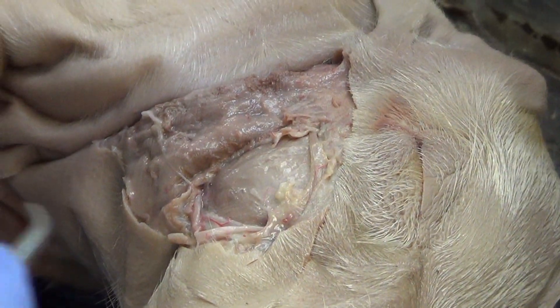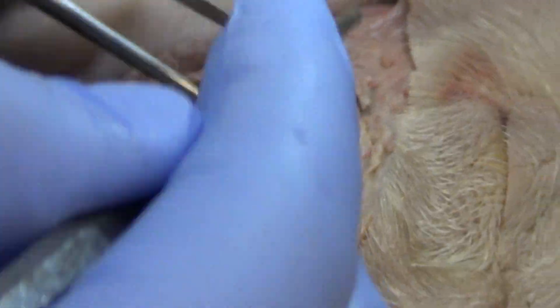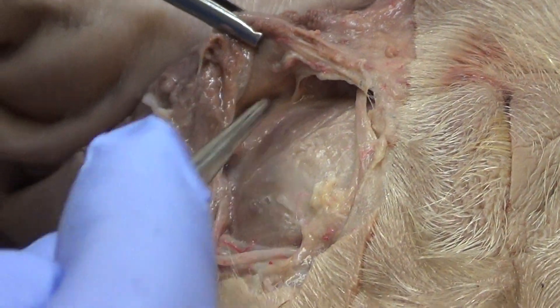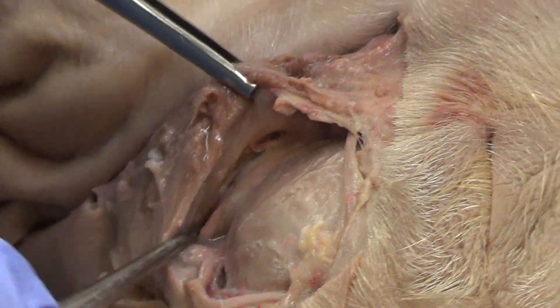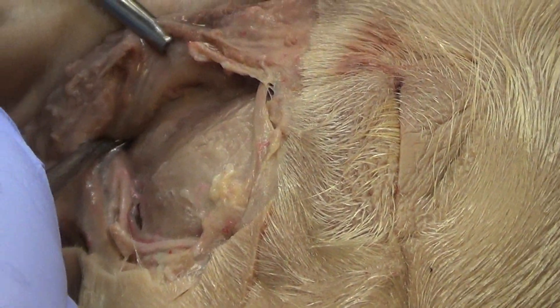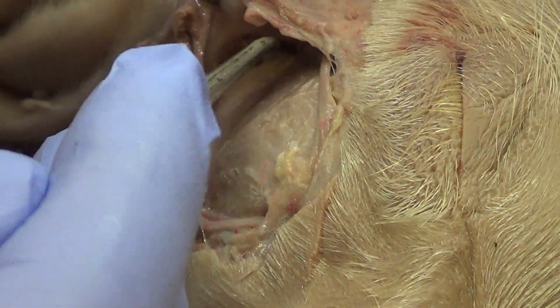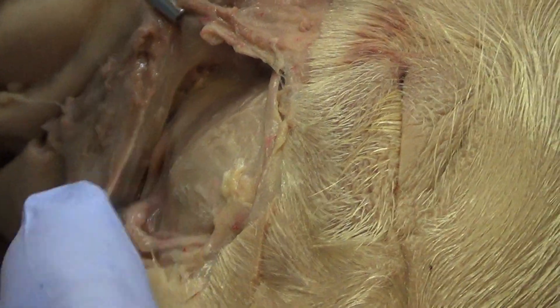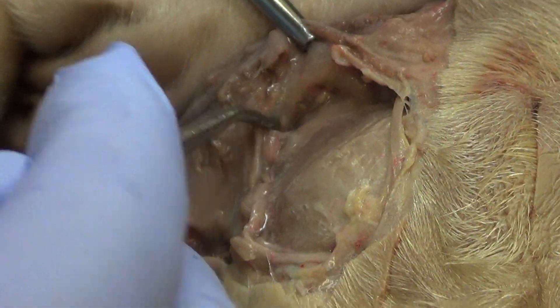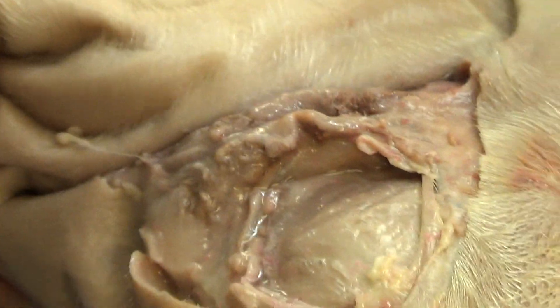Hiding underneath the parotid gland will be the next salivary gland. I'm going to take my probe — right here is the submandibular gland. I'm just going to work some of that out. Submandibular gland: where does it send saliva? Under the tongue at the lingual frenulum.